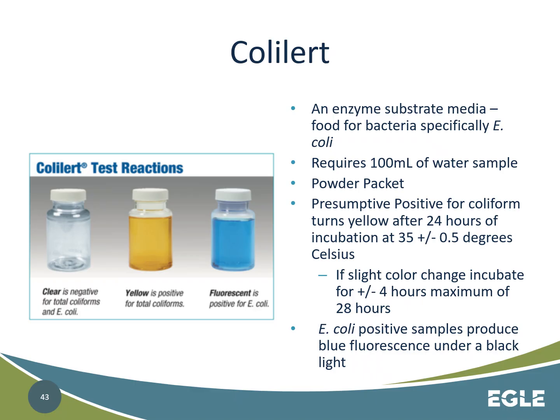for analysis to see if it's positive for coliform and then E. coli. So they have a color comparator that comes with the stock of media when you receive it from the manufacturer. Now, if the sample is lighter than the color comparator, so it has a slight tinge of yellow but it's not as dark as the comparator, the lab will place it back in the incubator for no more than 4 hours. If they pull it out at a maximum of 28 hours and it still hasn't changed darker than the comparator, it's considered negative for coliform bacteria.